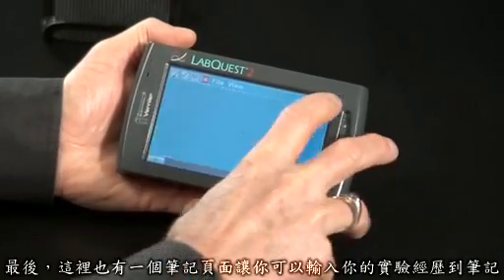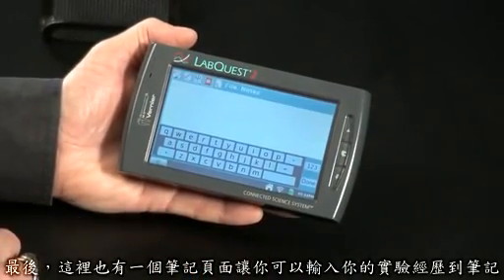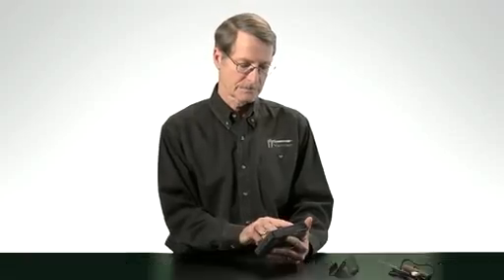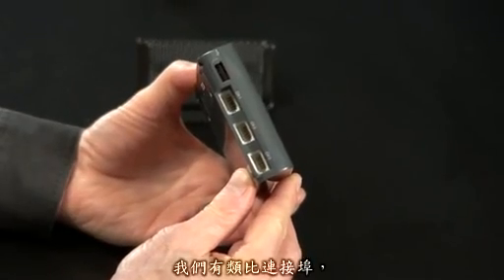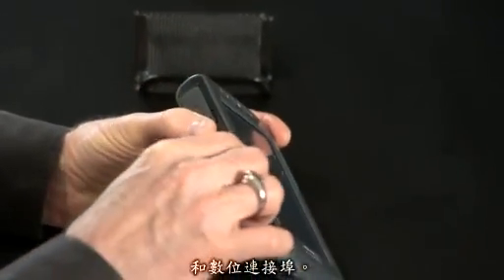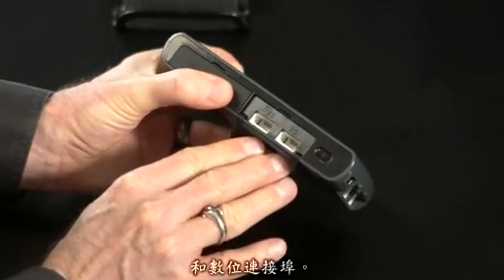Finally, there's a notes screen where you can type notes for your lab experiment. And as you would expect, the LabQuest 2 works with over 70 of our sensors. We have analog ports and digital ports.